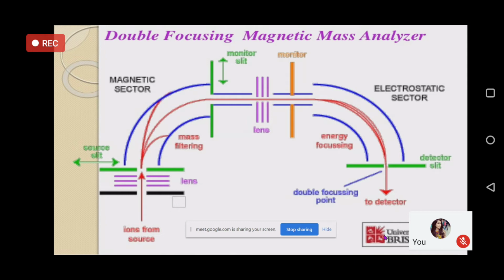Ions moving with velocities lower than that or higher than that will get deflected more and will reach the walls of the two electrodes. So the point is, what we are assuming here is there is a velocity distribution, which is called the Maxwell-Boltzmann distribution of velocities. All of you are familiar with the Maxwell-Boltzmann distribution of velocities.